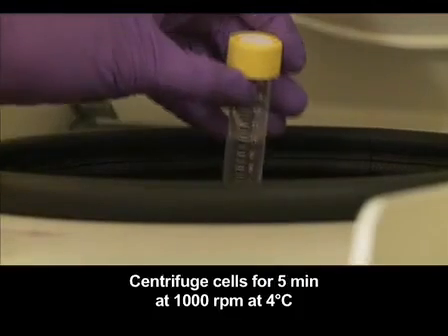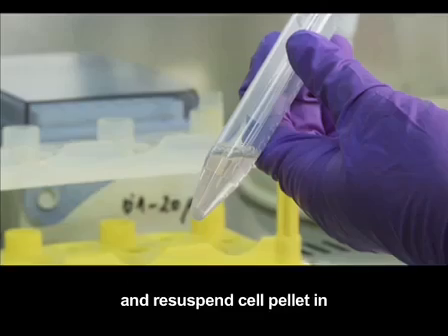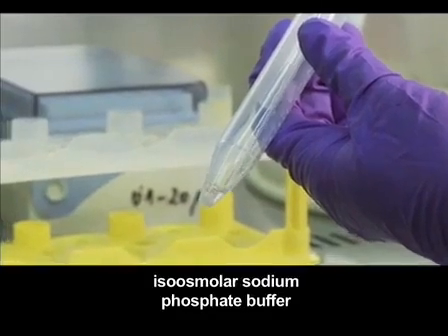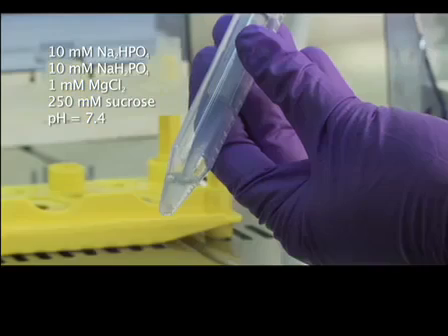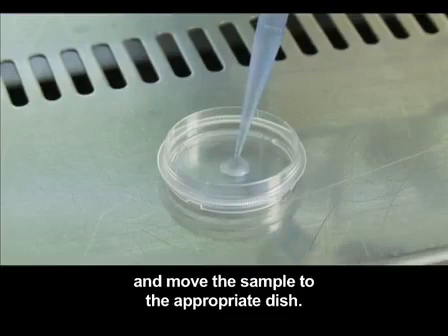Centrifuge cells for 5 minutes at 1000 rotations per minute at 4 degrees Celsius and resuspend cell pellet in isoosmolar sodium phosphate buffer to a cell density of 5 million cells per milliliter and move the sample to the appropriate dish.